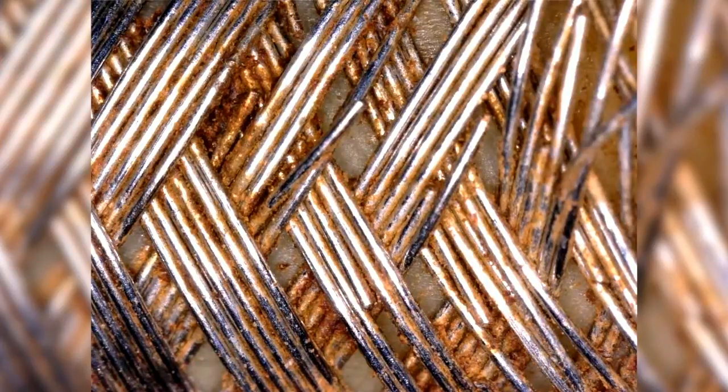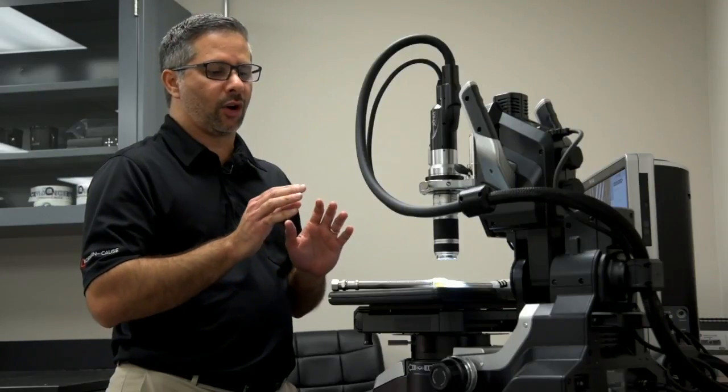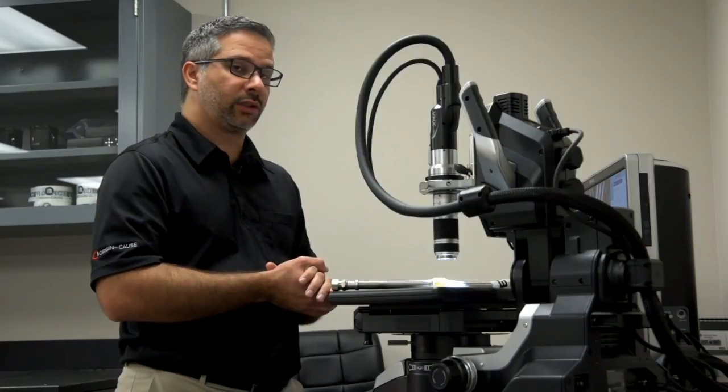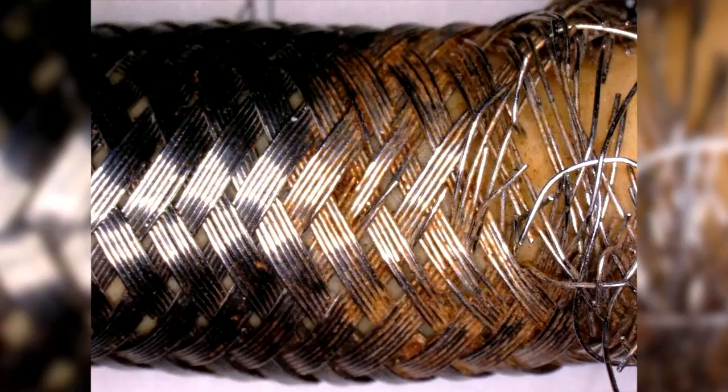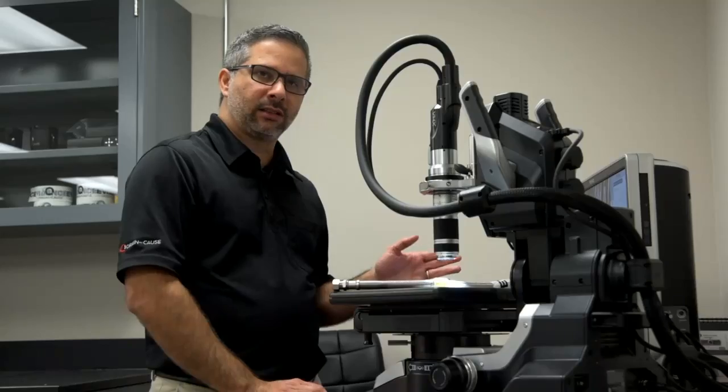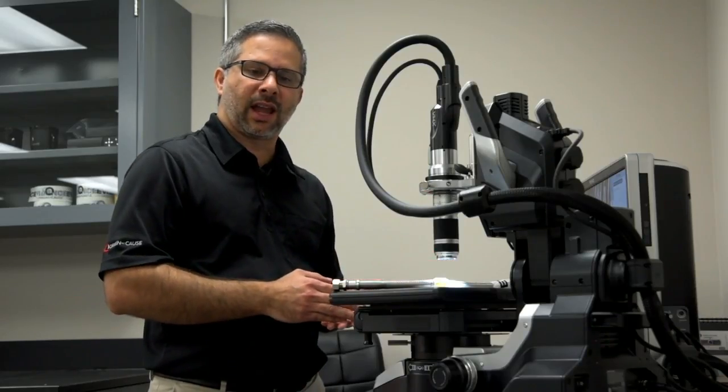That type of corrosion typically occurs because of chemical attack on a material that is not adequate for the application, or simply substandard. So now that I've determined what type of corrosion we're dealing with, I can understand what the next steps I have to do.